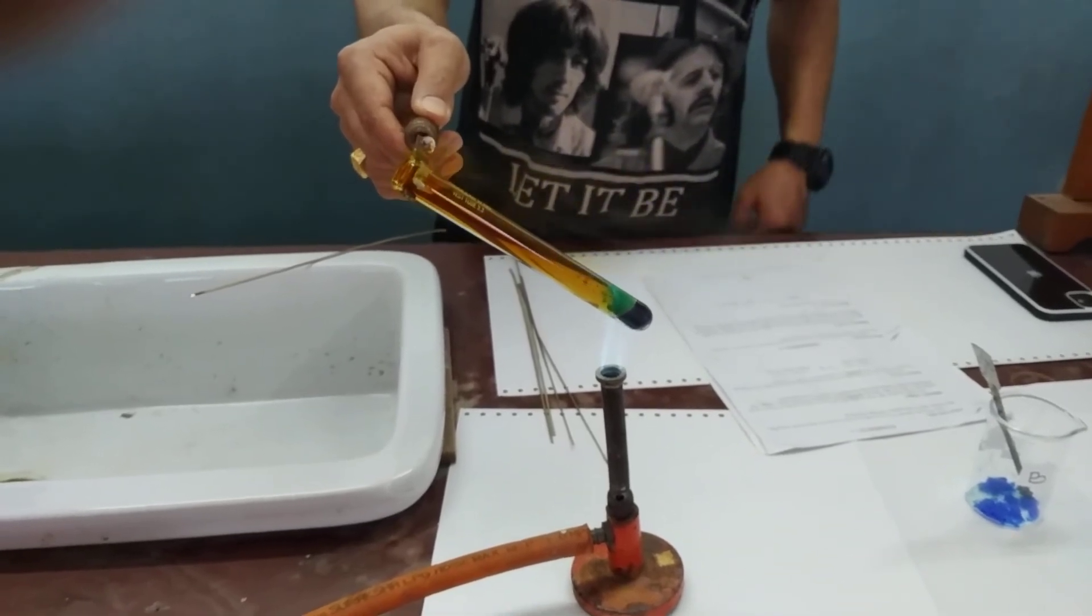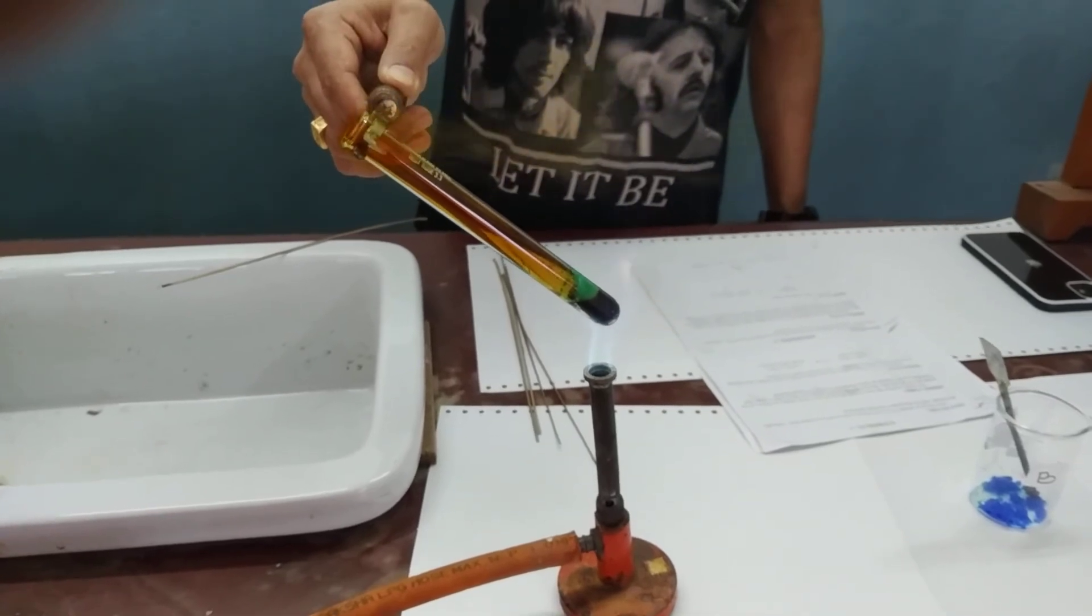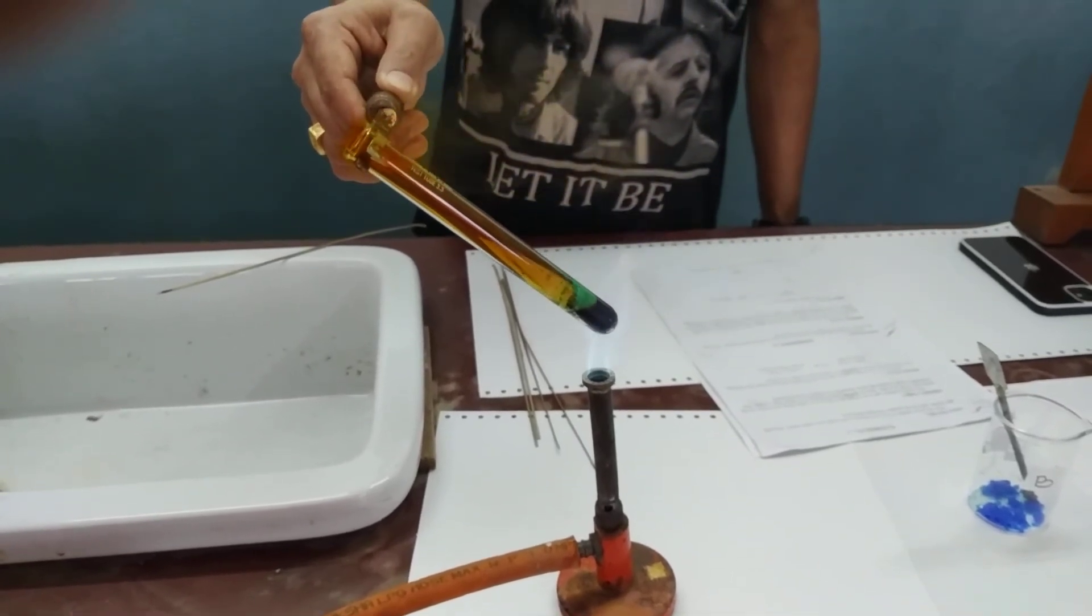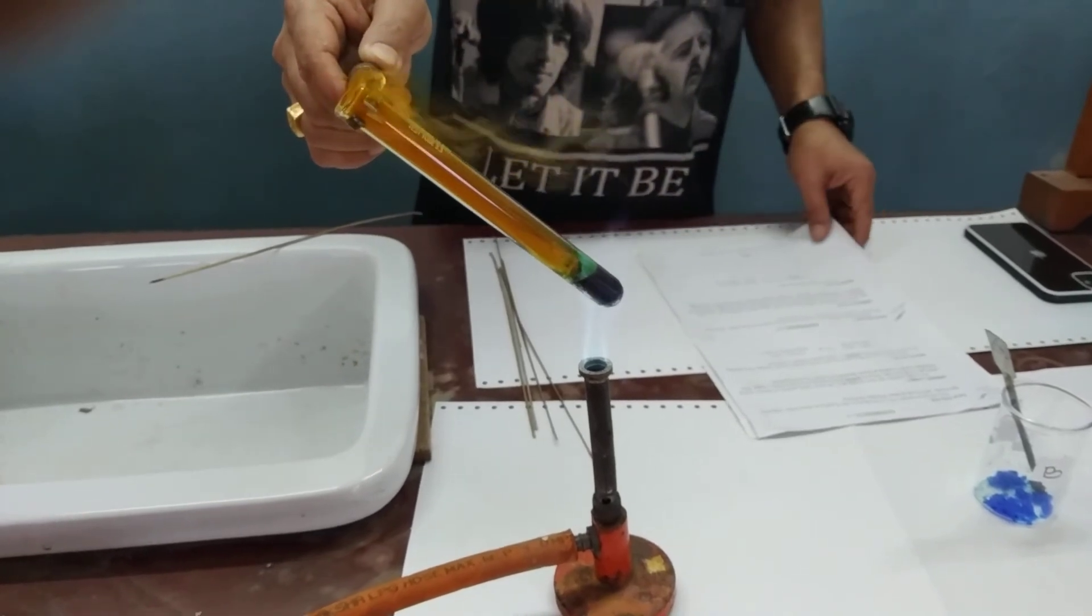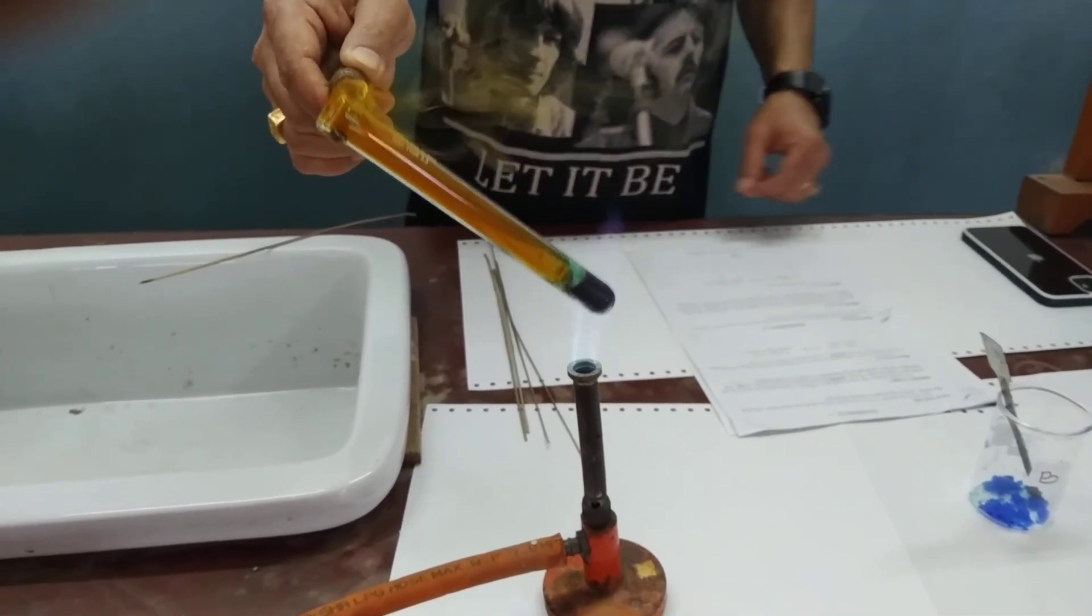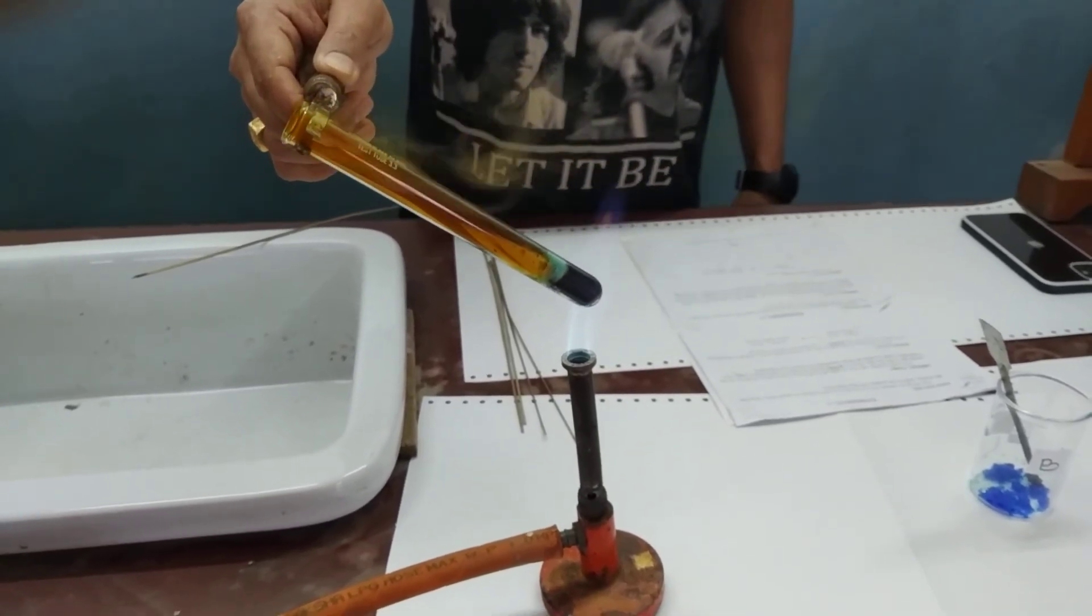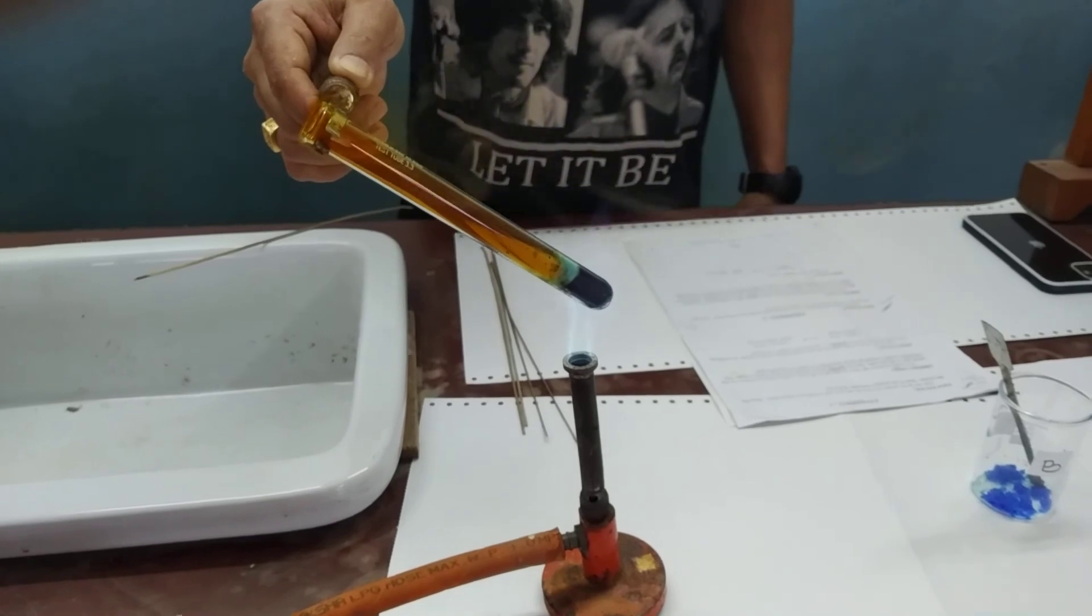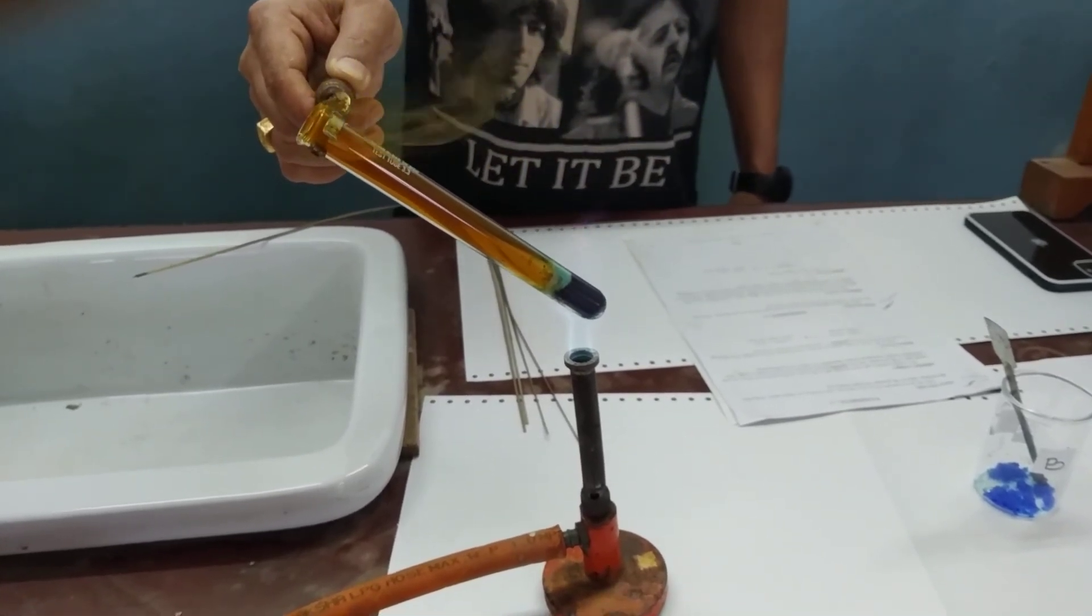From this experiment, we can conclude that the given salt is copper nitrate. The salt was blue in color, and since it produces nitrogen dioxide gas, it must be a nitrate. Therefore, sample B is copper nitrate.